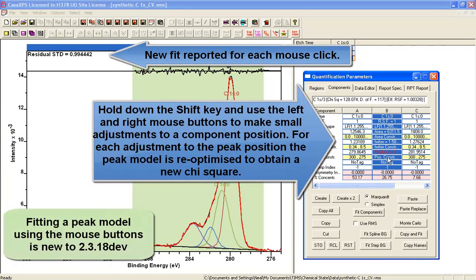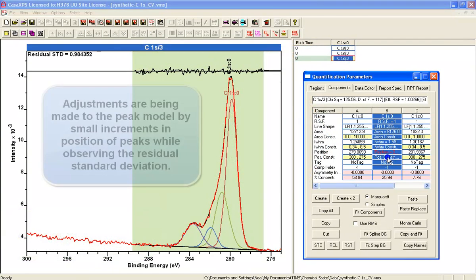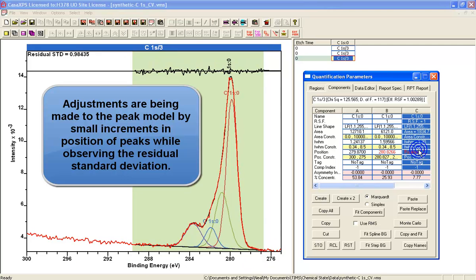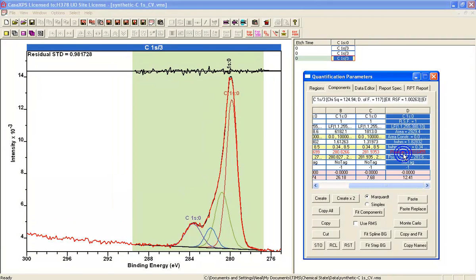Now we can even start to improve this residual standard deviation. This option allows you to fix a peak position and then just move it slightly and refit. So what we're doing is holding the shift key down and then clicking the left and right mouse buttons to move the peak and refit the data. And the idea is that we should come up with a better residual standard deviation and therefore hopefully a better peak model.